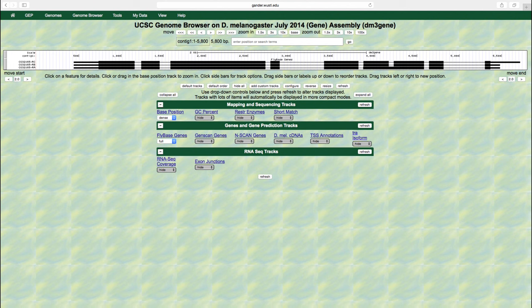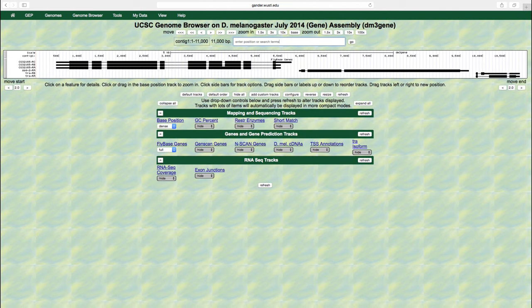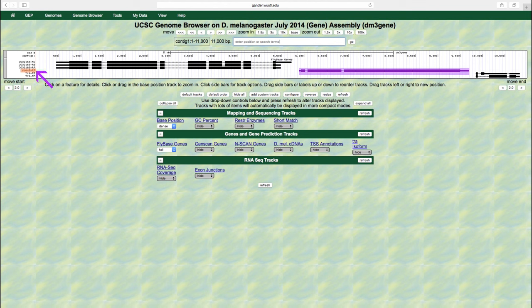Let's zoom out to the entire contig 1 and look at the SPD2 gene. Enter contig 1 into the enter position or search term text box and then press enter. We can see that there is only one isoform of this gene, isoform A. Therefore, only one kind of mRNA is transcribed.